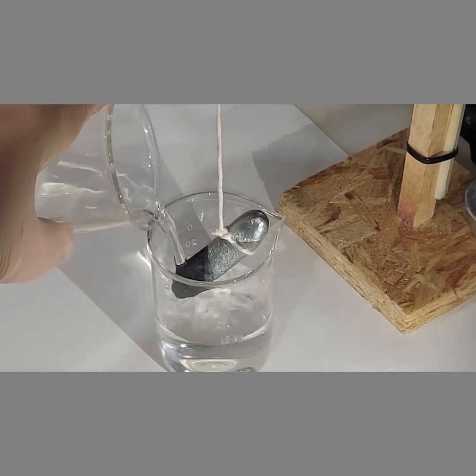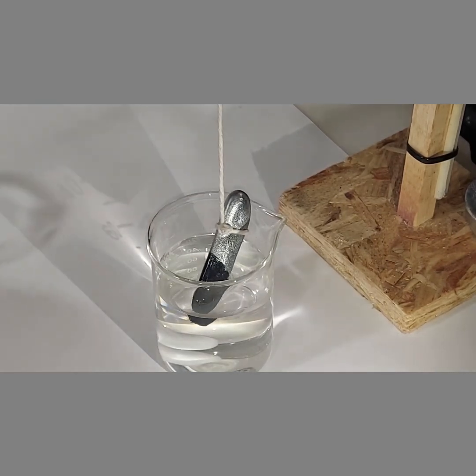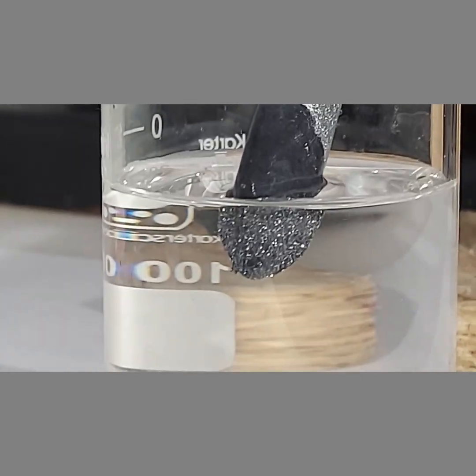You can already see it affecting the zinc rod and changing its color. You can already see the lead crystals growing — it's only been about a minute.